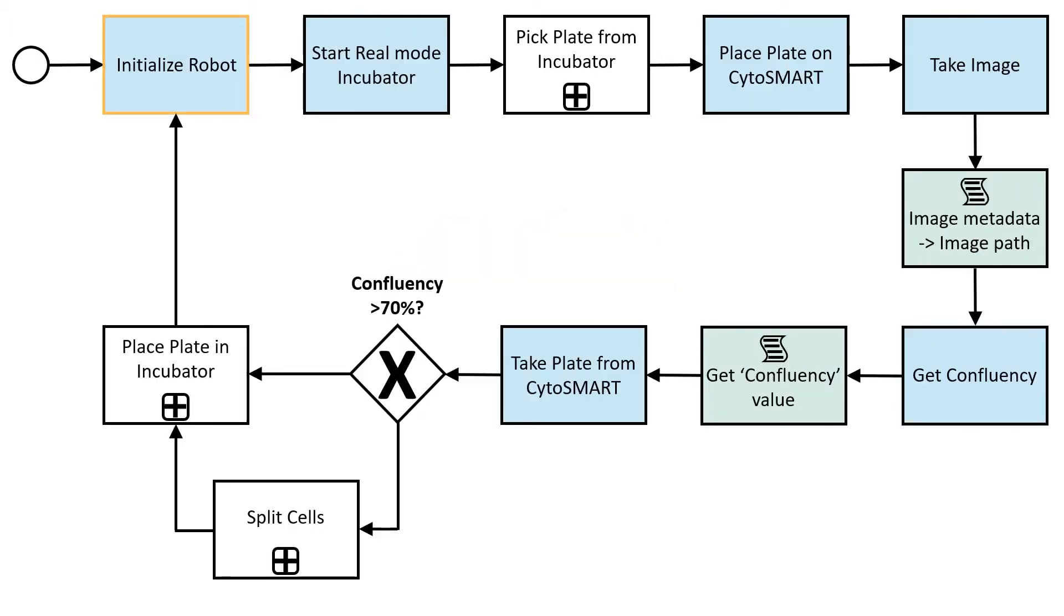Here's a glimpse of Adorcia's experimental autonomous lab automation system. Without human intervention, it maintains growing cell cultures ready for substance testing.